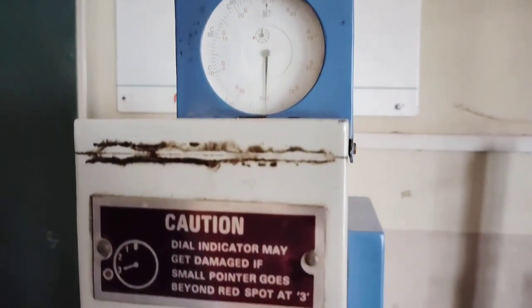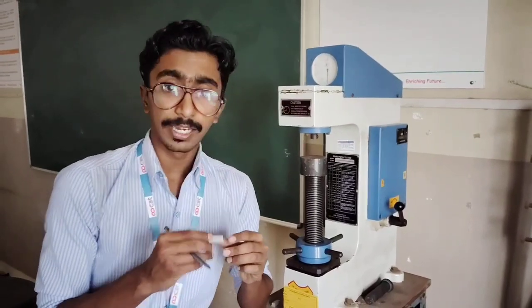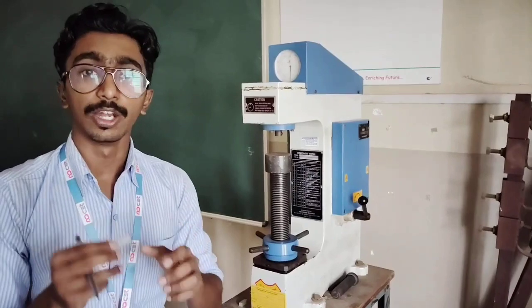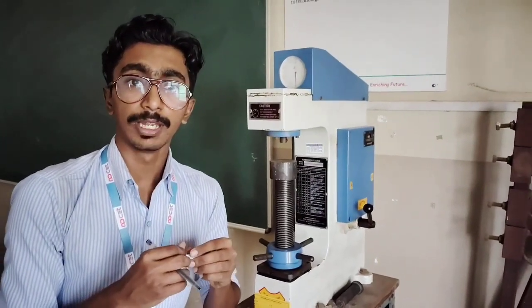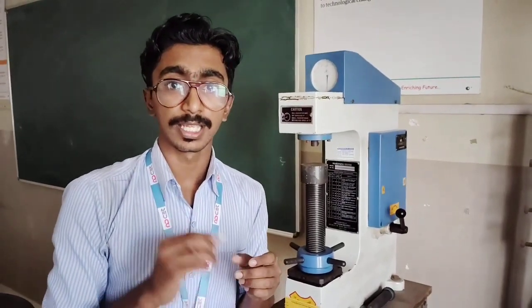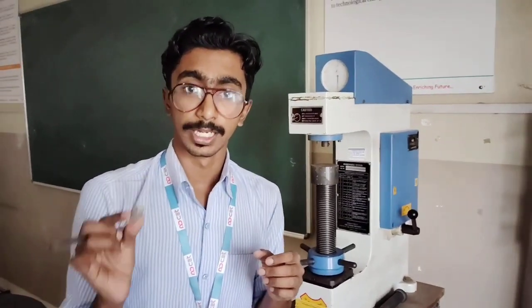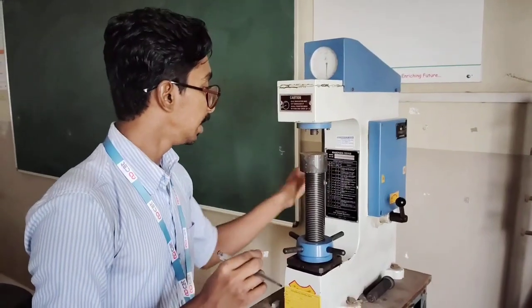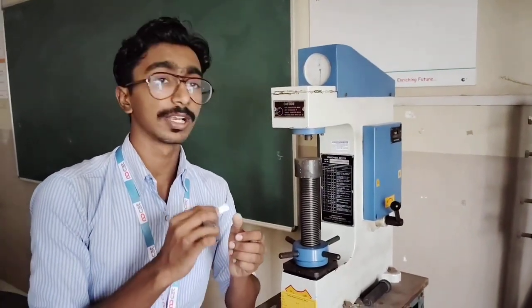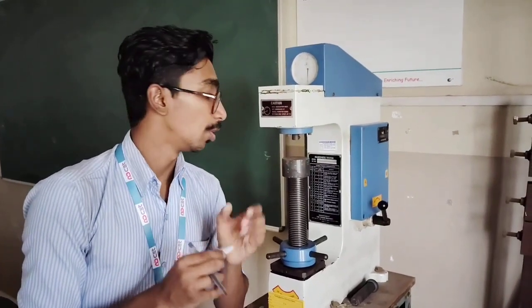In this way, we will conduct our experiment and we will get a value for aluminium, and the unit of the aluminium hardness value will be HRB. HR means Hardness Rockwell number, and B indicates the scale, HRB. So in this way, we will conduct our experiment on the Rockwell hardness test.